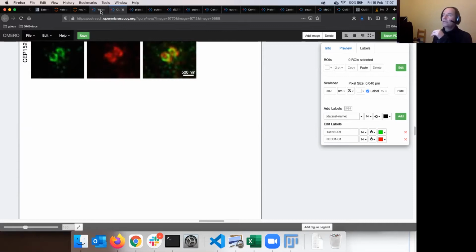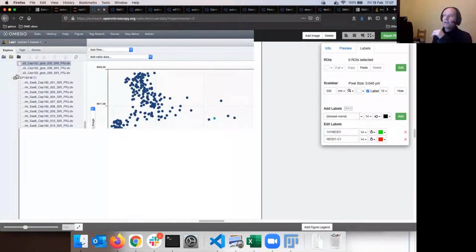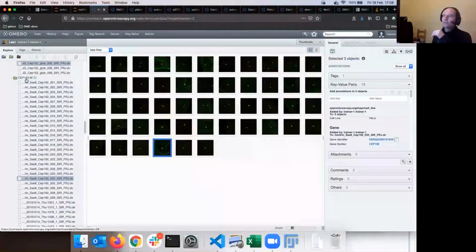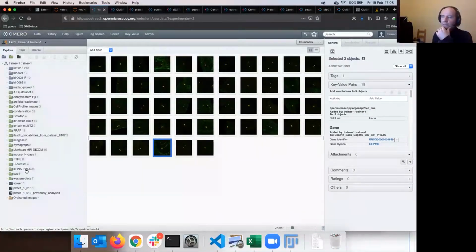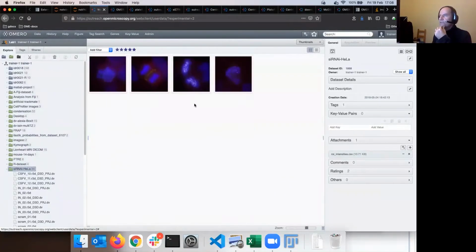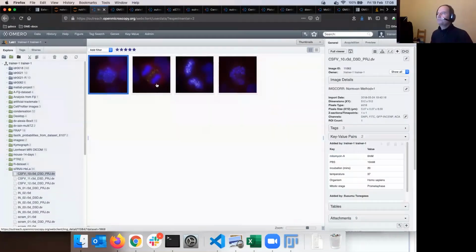I can add new images to this figure by going back to OMERO web and, let's say, getting rid of the parade for this workflow. I will collapse this large project and go to our favorite dataset called siRNA HeLa. You remember my first workflow shown yesterday, filter by rating. These are my best images from the mitotic phases. And I will select a couple of those images.